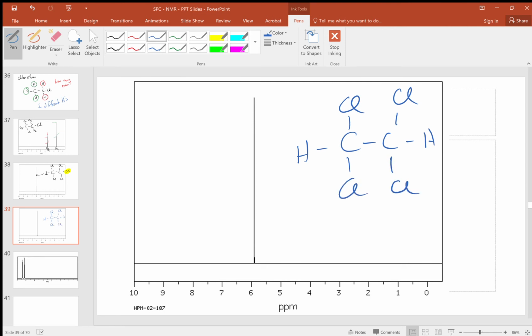First of all, this molecule is still symmetric. So these 2 protons are equivalent to each other, so they show up as the same peak. Second thing is, you may notice we went from about 6.1 ppm to just below 6 ppm. And that's because we lost an electron withdrawing group. So that makes sense. So nothing funny going on here yet.